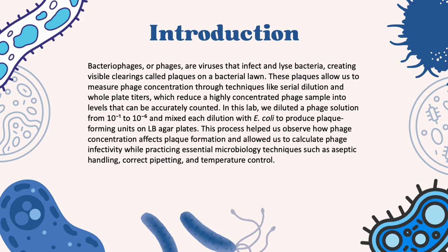In this lab, we diluted a phage solution from 10 to the negative 1 to 10 to the negative 6 and mixed each solution with E. coli to produce plaque-forming units on LB agar plates. This process helped us observe how phage concentration affects plaque formation and allowed us to calculate phage infectivity while practicing essential microbiology techniques such as aseptic handling, correct pipetting, and temperature control.